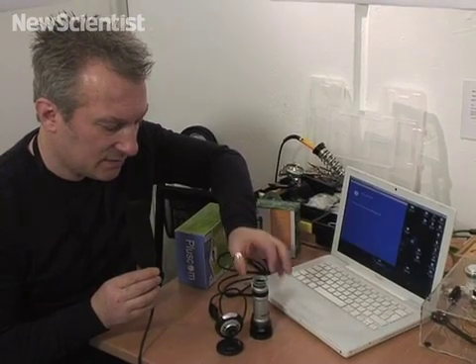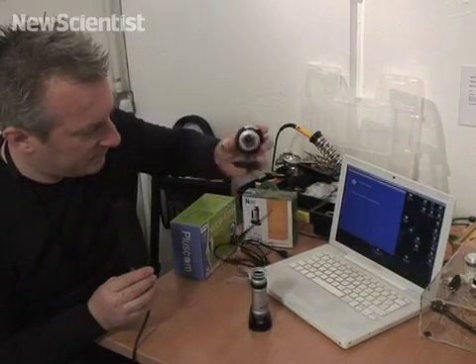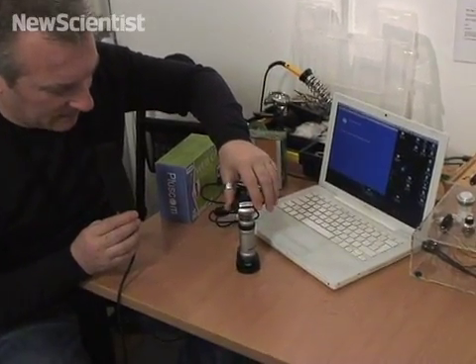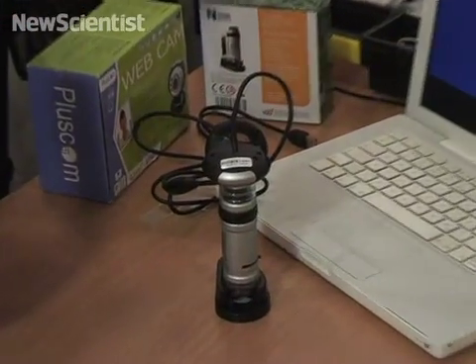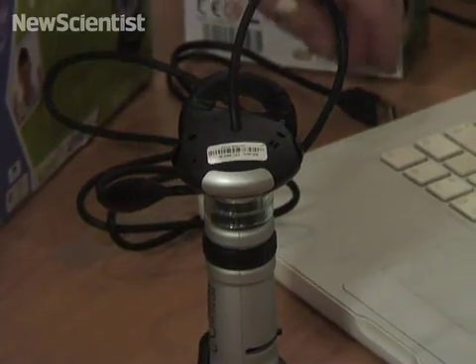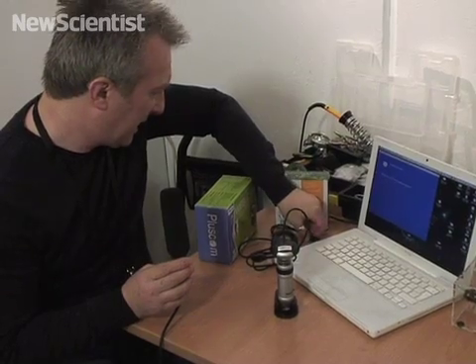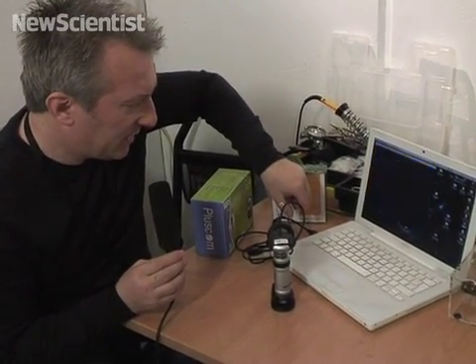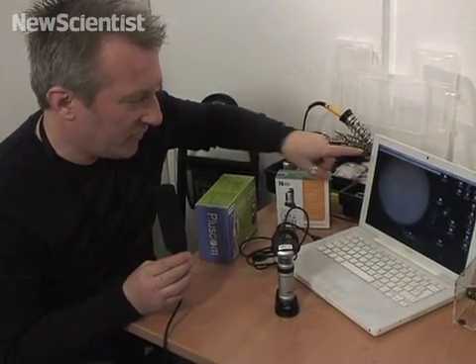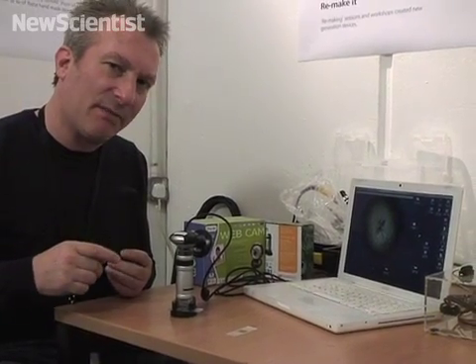So we fit the ring over the eyepiece of the microscope and literally just slot the web camera on top like that. And hey presto — no need for glue or any deconstruction of the camera itself. Now we just take the USB cable, plug it into the computer, which is already running a program called Webcam Monitor. This is a freeware program.